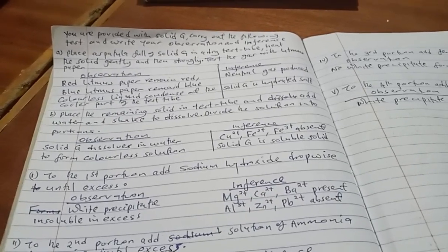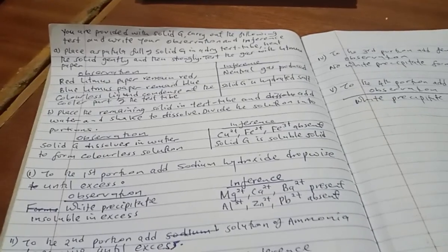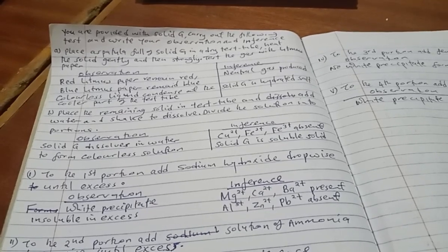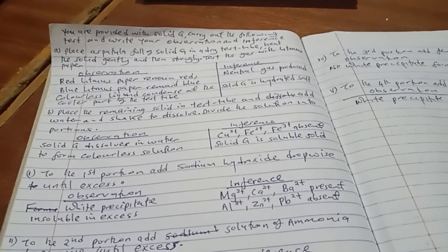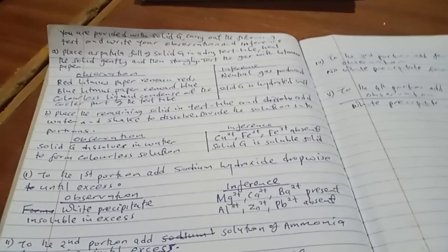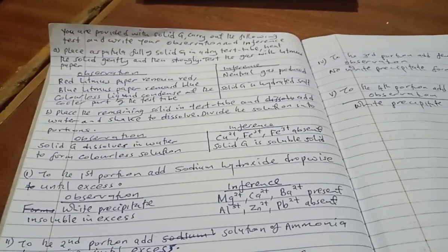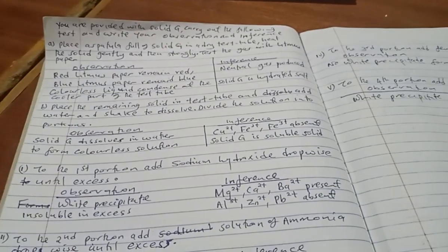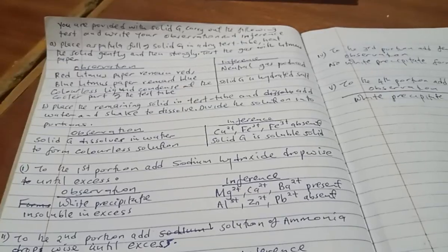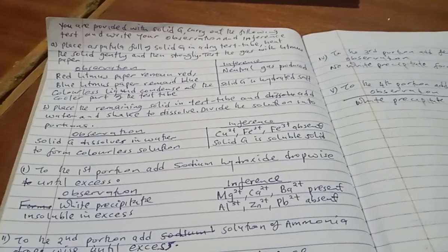So when you are told to test the gas with litmus paper, you expect 3 observations. Number 1, red litmus paper turns blue, then you say a basic gas is produced. Then blue litmus paper turns red, you say acidic gas produced. If both the red litmus paper and the blue litmus paper do not change, the red remains red and the blue remains blue, what do you write? You write neutral gas produced under inference.